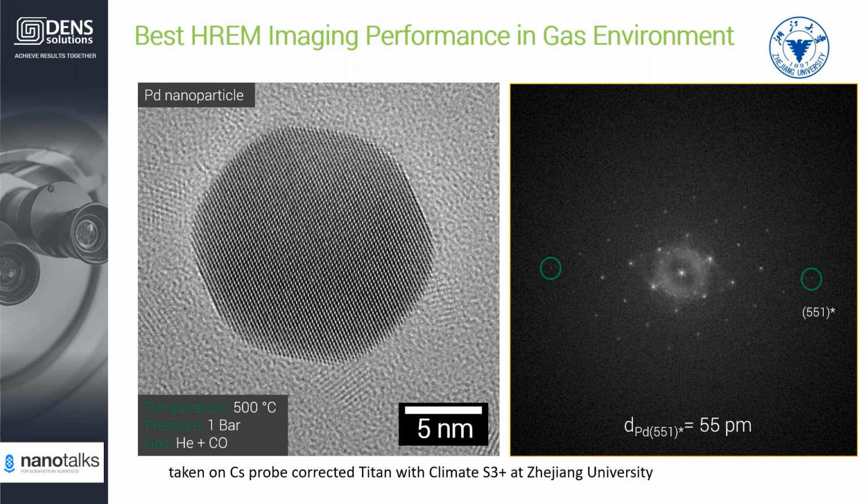such as parallel beam electron diffraction, where, for those of you who are not particularly familiar with this technique, what we do is we sputter the chip with gold. We de-wet it, and then we create gold nano islands, where by doing that, you can use each of these gold nano islands as an individual thermometer.